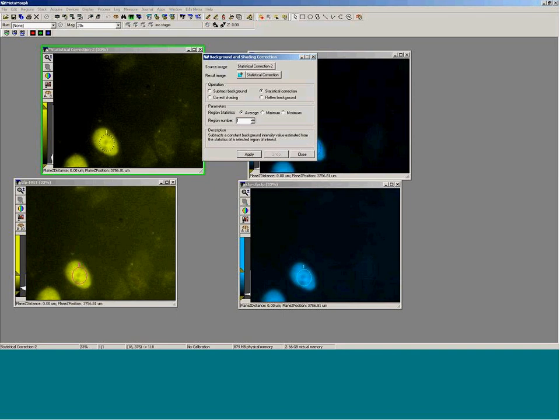Okay, so this is our double-labeled sample that is expressing FRET. We have the CFP and YFP samples that have been imaged with just the YFP filter set, with the CFP filter set, and with the FRET filter set that's here.